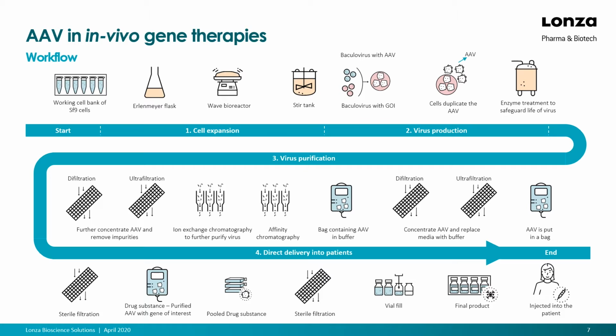The following step will be to harvest the cells and the supernatant and treat it to release and protect the AAV particle. Then, the viral vector particle will be purified through multiple filtration steps, dialyzed, and purified through column chromatography steps before being ready for use.